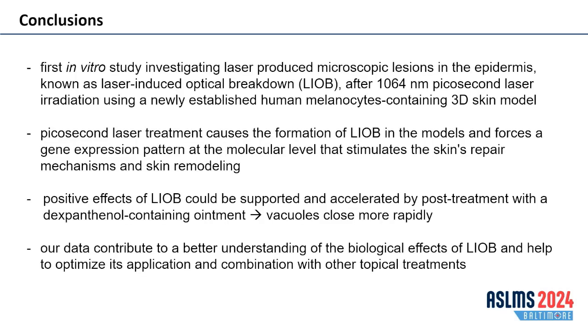With that, I want to conclude. We present the first in vitro study investigating LIOB effects after 1064 picosecond laser radiation using a new 3D skin model containing melanocytes. The picosecond laser treatment causes the formation of LIOB in our models, and it forces a gene expression pattern at the molecular level that stimulates the skin's repair mechanisms and skin remodeling. We found that the positive effects of LIOB could be supported and accelerated by a post-treatment with a dexpanthenol-containing ointment.